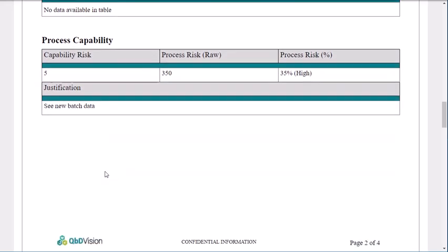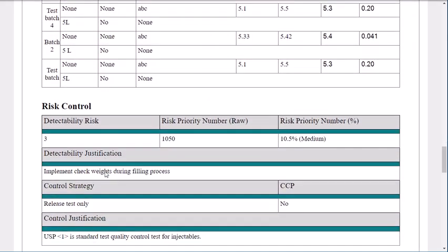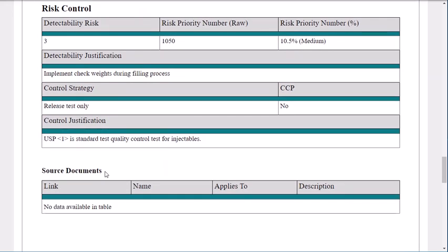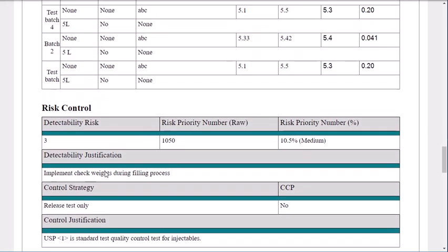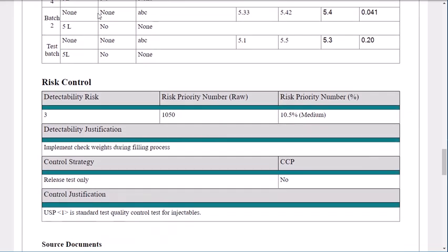The risk assessment carried out on the requirement's criticality impact to the output is also displayed along with the process capability results. As is the case with many industrial processes, the manufacture of various batches and lots can often mean data interactions and patterns are lost between different data sheets. Aggregating raw data and applying statistical methods is the proven way to demonstrate any changes to criticality of an attribute, and the reports are configured to include all raw batch or lot data for full transparency.